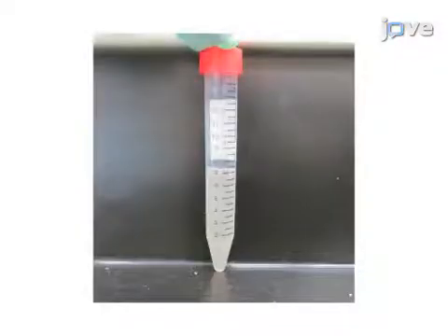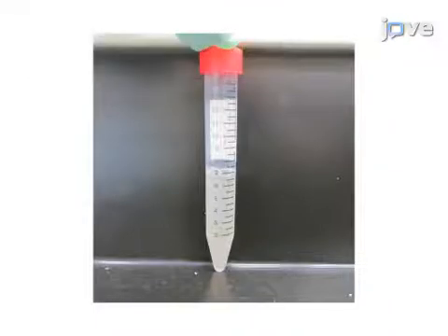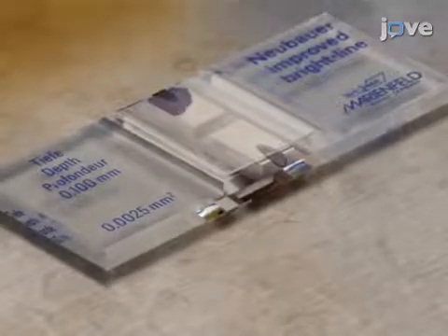To begin this procedure, obtain the mononuclear cells by leucophoresis from human donors and then enrich the monocytes by continuous counterflow centrifugal elutriation of mononuclear cells. After that, count the cells using a hemocytometer.